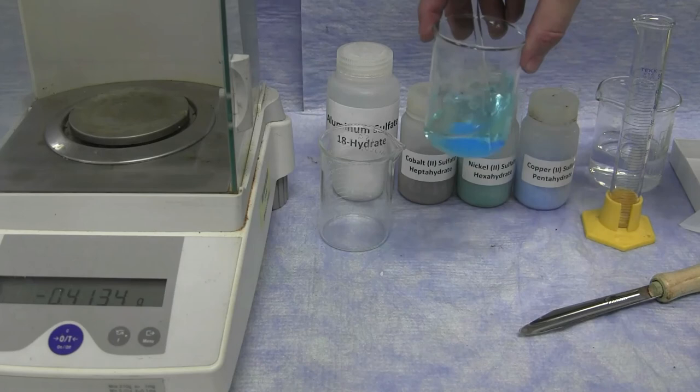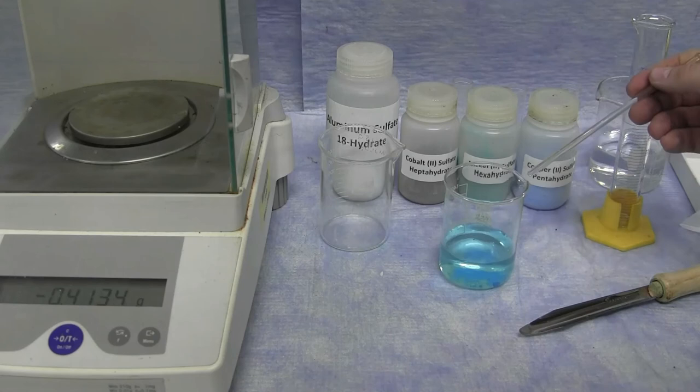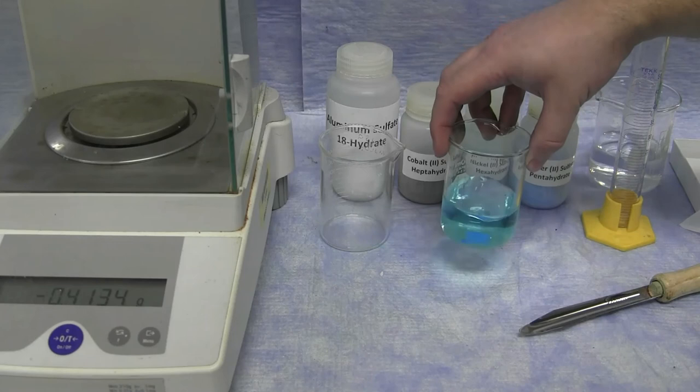You'll be preparing two solutions. One solution of a transition metal sulfate, either cobalt sulfate, nickel sulfate, or copper sulfate. Each of these are a colored salt. And you'll prepare that solution and wait for the material to dissolve.